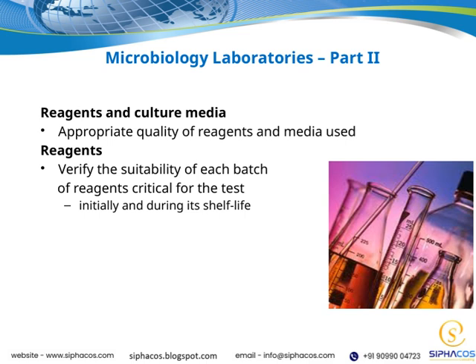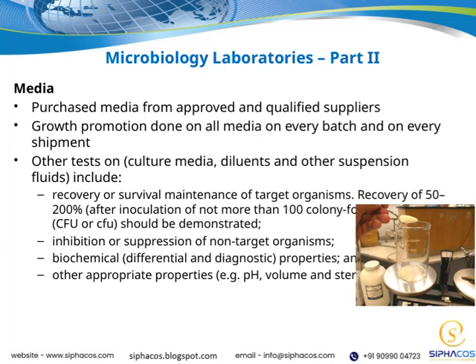By maintaining strict quality control of our reagents and media, we uphold the integrity of our microbiology practices and ensure our results are trustworthy. This is a key part of overall laboratory quality management and directly supports the accuracy of our diagnostic conclusions. Let's start by talking about the media we use.